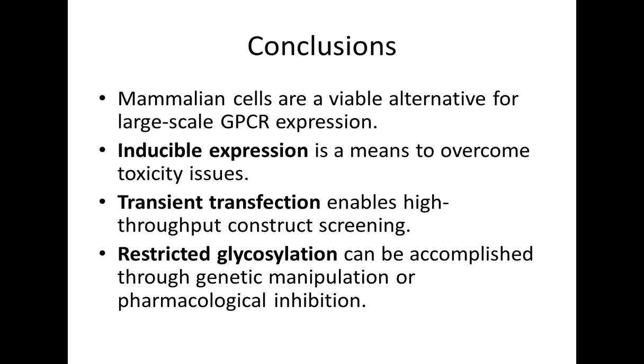Another thing that has been done is co-transfecting receptors with some of their transducer proteins, like heterotrimeric G proteins. In some cases, people have actually been able to purify entire complexes of GPCRs bound to a transducer. This was done for a couple of cryo-EM structures of receptors with G proteins in recent days. So yes, both of those have been explored as possibilities.